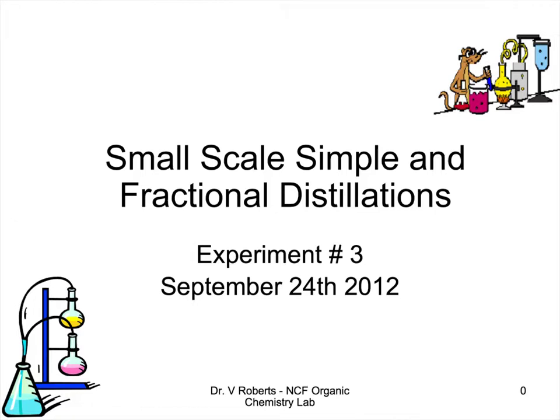Today we're going to be doing an experiment that compares and contrasts simple and fractional distillation. Distillation, in essence, is a procedure that allows us to purify liquid substances. Just like we did recrystallization to purify a solid substance, we're going to be doing distillation to purify liquid substances.